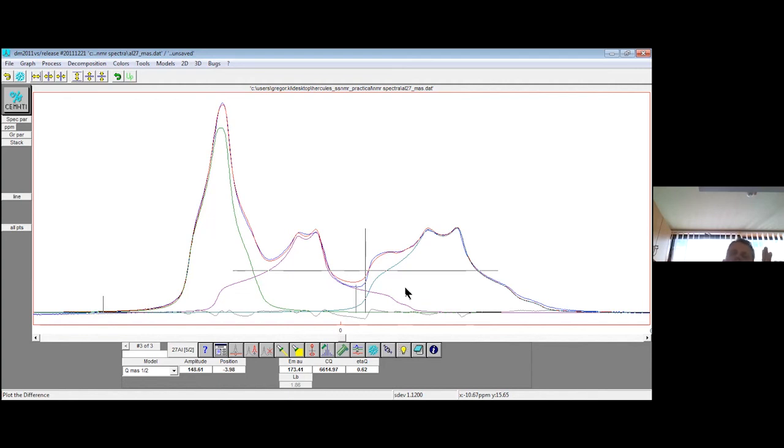In Simpson, you can say, okay, I have a duration of the excitation pulse of 1 microsecond, my irradiation field is that and that strong, and I'm that many kilohertz off the center of the signal. So it takes into account all these factors and then probably gives a better line shape, but it is way slower and more difficult to use, right? So this is the problem with quadrupolar spectra.